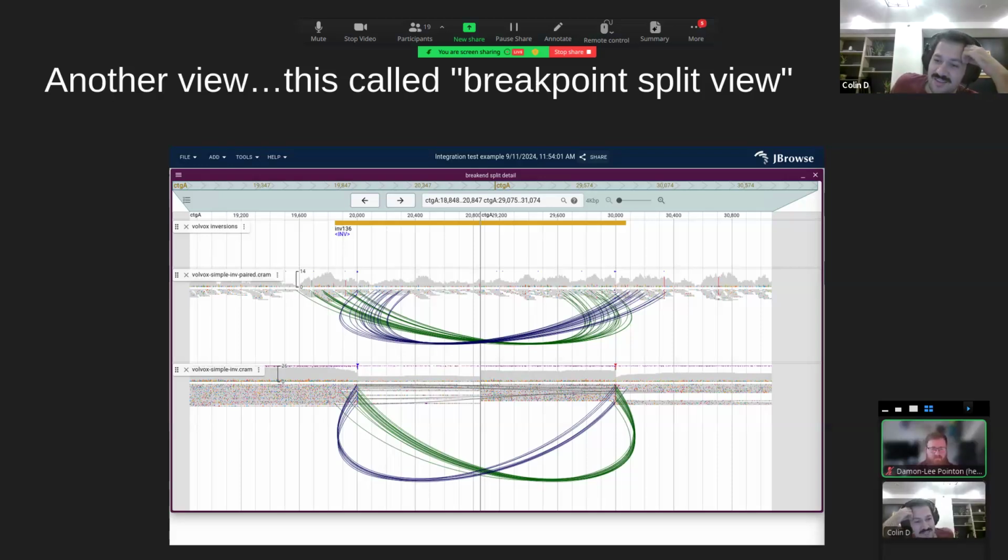So it's sort of been a slow burner, but I've been trying to make a refactor of the Spreadsheet View, aimed at being able to load bigger files because it slows down at pretty moderately sized files and even crashes.